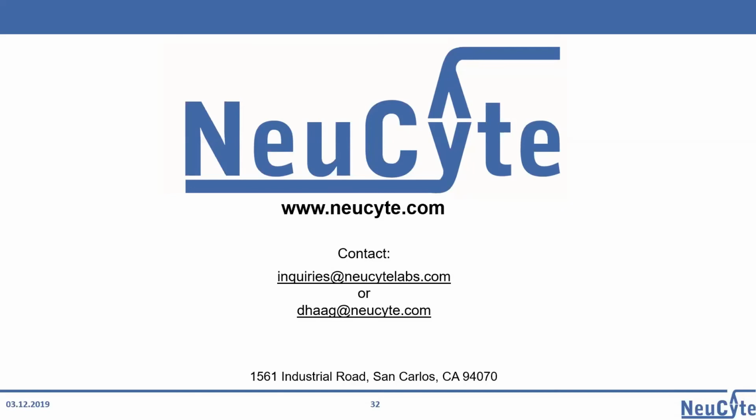So that is purely empirical. We were informed by literature ranging from 50-50 in some regions, but mostly 80-20 in most cortical regions. So we were simply testing different seeding ratios and tested the robustness of the network development and the responsiveness to AMPA and GABA modulation. And we found that the seeding ratio of 70:30 gave us the most robust and the most sensitive response to modulation of the inhibitory and excitatory components in the coordination.